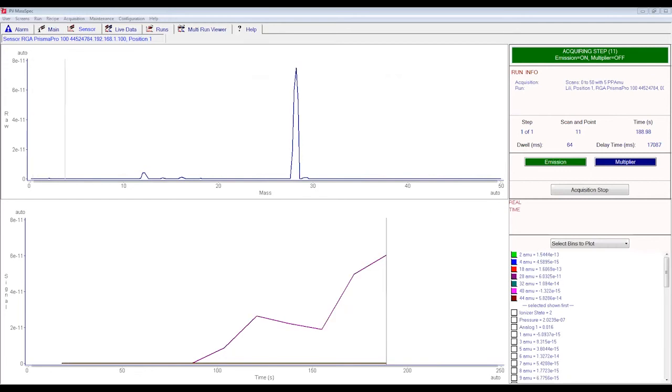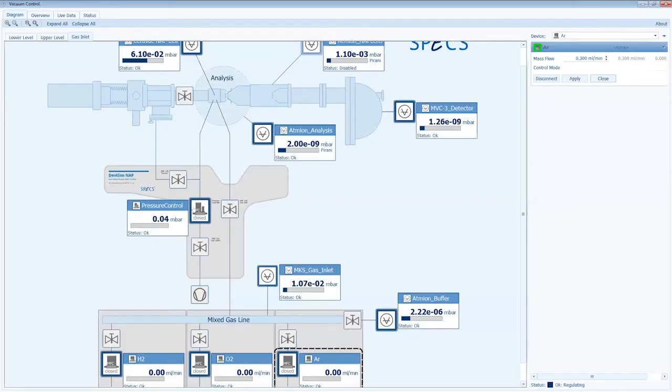There's another thing, I don't know if you mentioned. We have a pressure controller, a so-called DC pressure controller, that can actually pump the gas out of the high pressure cell. You can either keep it closed like it is now, then all the gases coming inside the chamber are escaping only through the nozzle. So you are actually analyzing, as Misha mentioned, everything from the stage, the background, the walls, and it's difficult to say where the product is coming from.